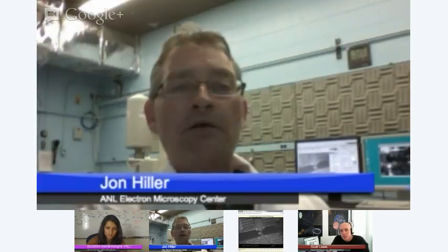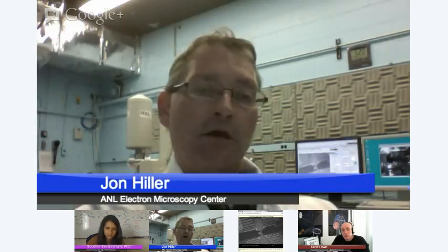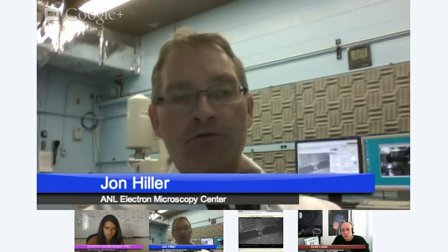Okay? And so electrons have a very, very small wavelength, which allows them to penetrate into a sample and see or resolve things much better than an optical microscope. So how do we do that? An optical microscope, like everybody knows, has lenses, and so does an electron microscope, but it's not a typical lens like in your glasses. We use electromagnetic lenses, okay? So first we have to get the electrons out, and what we do is we have what we call an electron source, and there are different types.